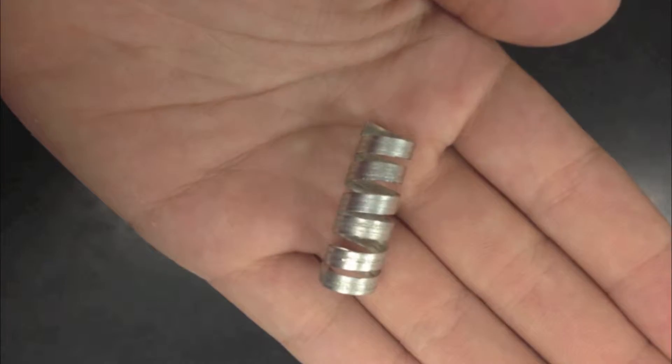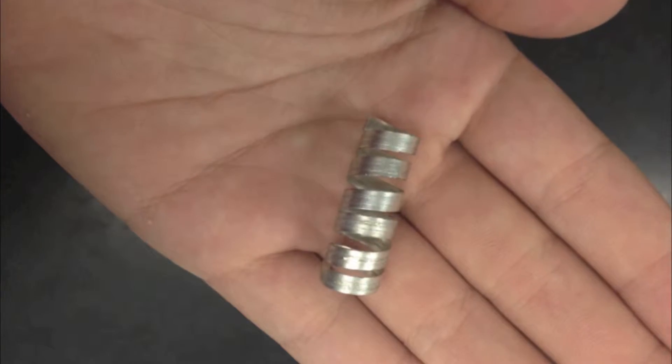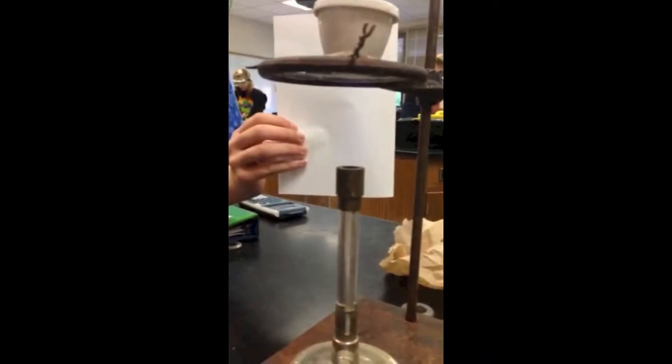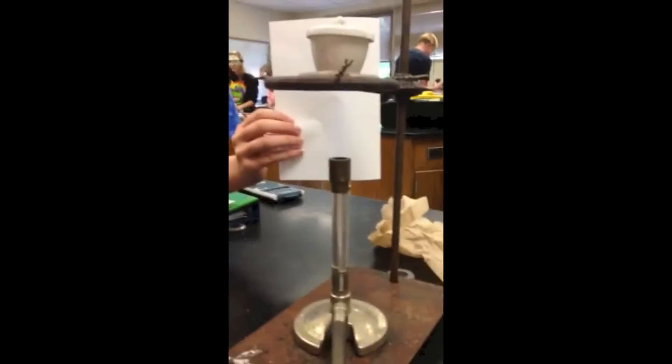We have prepared a 20 centimeter coil made from straight magnesium. We then placed the coil in the crucible and set it on the Bunsen burner. If you look closely, you can see the flame leading up to the crucible.